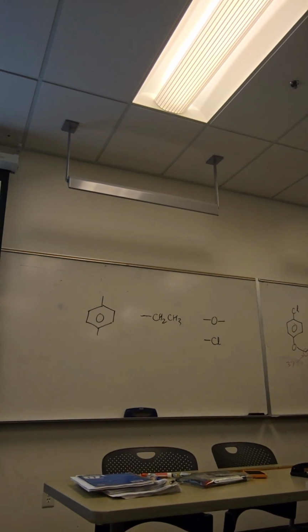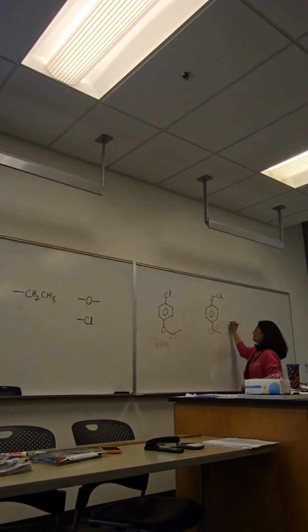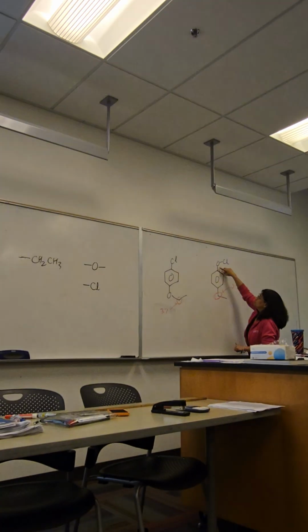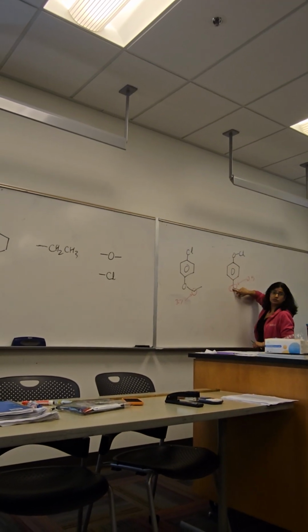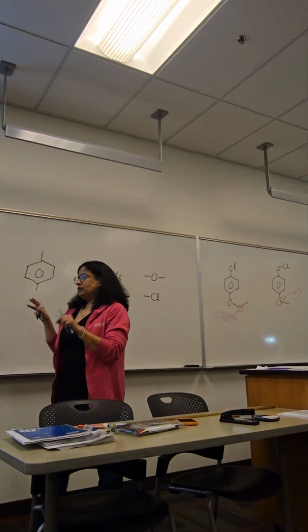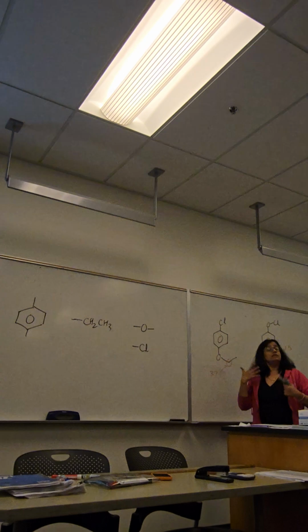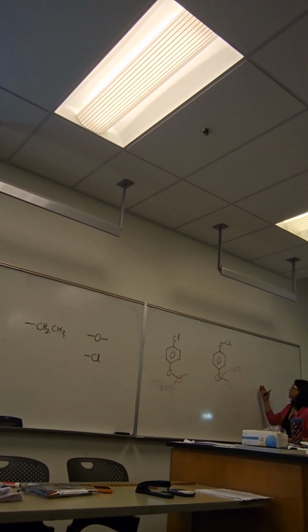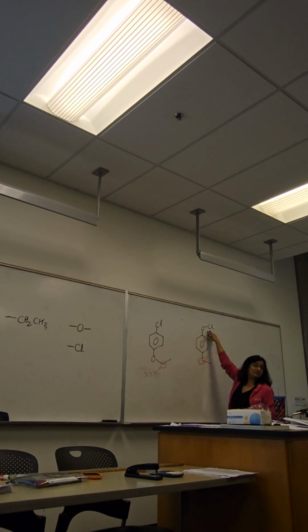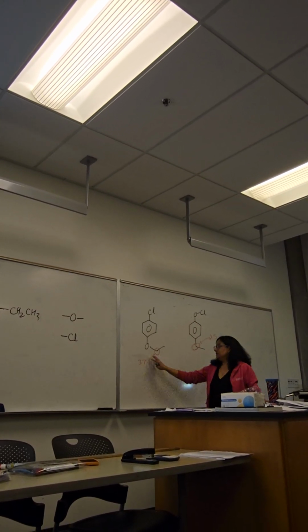Between 2.0 and 3, where do we expect those to show? CH2, 2.5-ish, right? Even though that's 3, but I can understand because this might have some effect on those signals. So I'll be very honest, I'm a little bit doubtful here. If I had to pick one of those two structures that would align better with the spectrum shown, I would pick this structure. Although that structure just makes me queasy just by looking at it. But based on the spectrum, it can't be this.